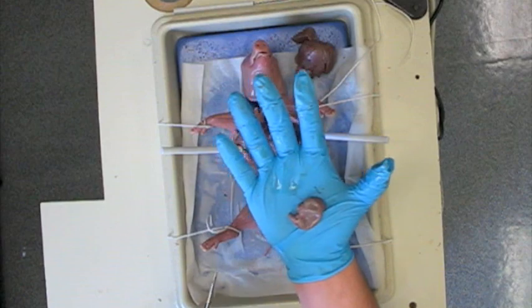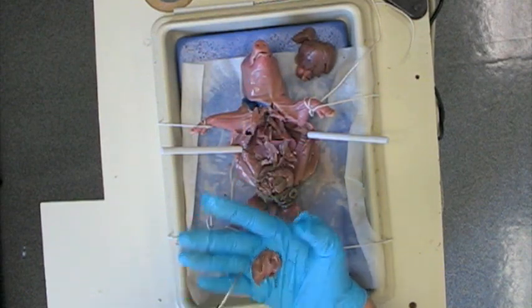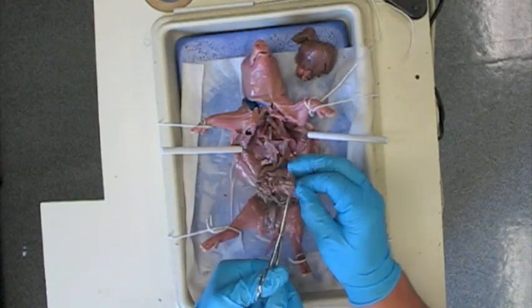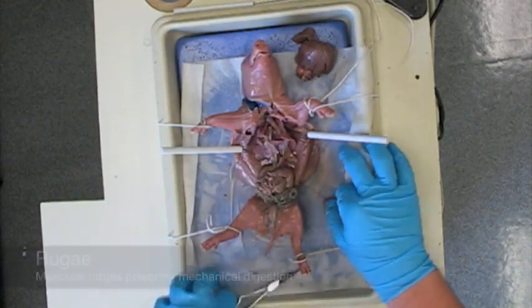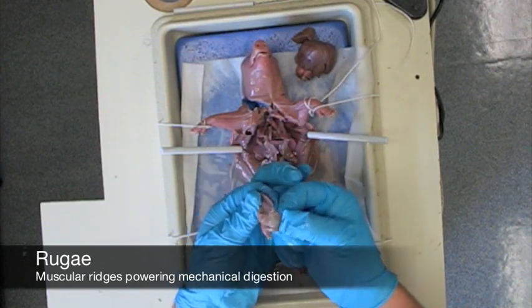A good organ to examine up close is the stomach. The stomach may still have some material inside of it when you cut it open, so be prepared. This particular stomach was almost empty. Inside the stomach, there are muscular ridges called rugae. Rugae power mechanical digestion.